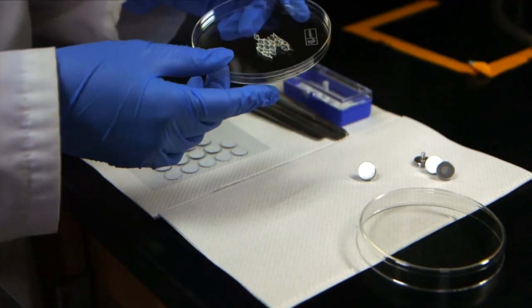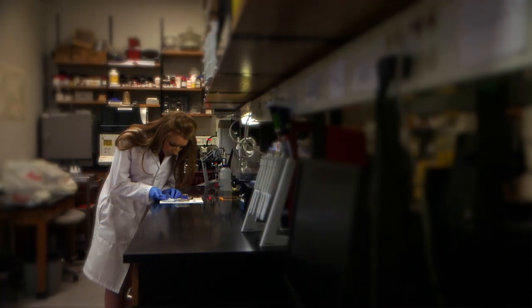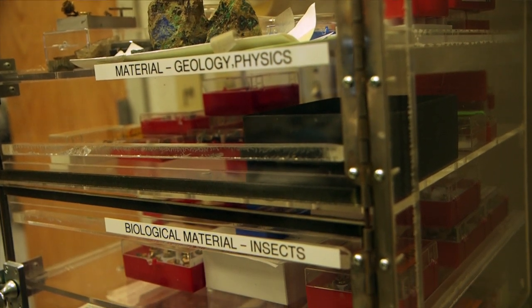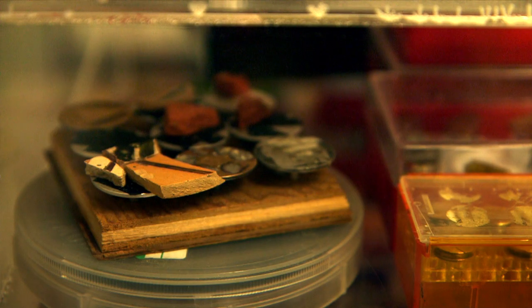Today we're going to be looking at some shed snake skin. The Imaging and Histology Core Facility — we call it IHCF for short — is basically a research center, and we're there to help researchers get images of their projects. We're here for scientists and people outside of the science world too.